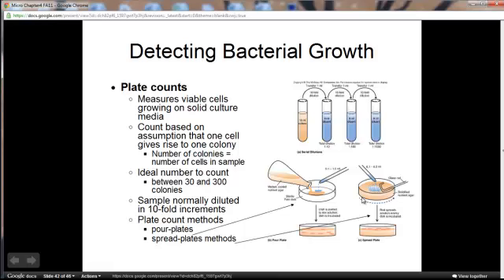There's no way you can individually count the cultures because they've all melted into each other. So you're going to have to also set up what's known as a dilution series. Basically, a setup in which you can dilute the culture to a point in which you can reasonably achieve isolated cultures on top of this plate here.